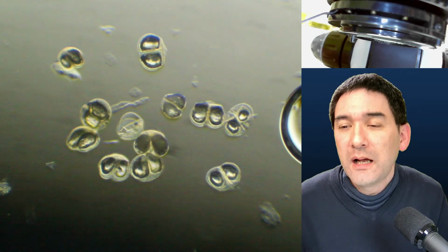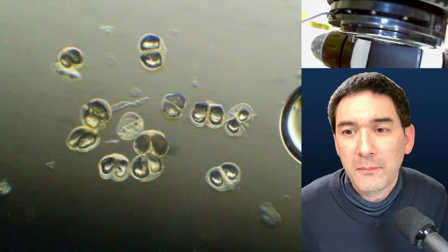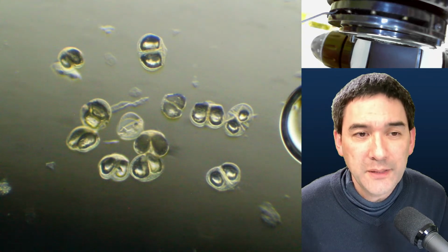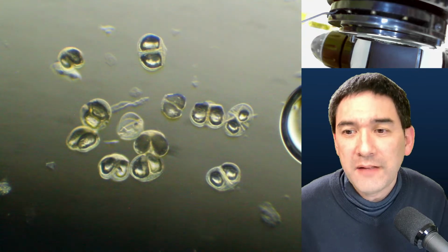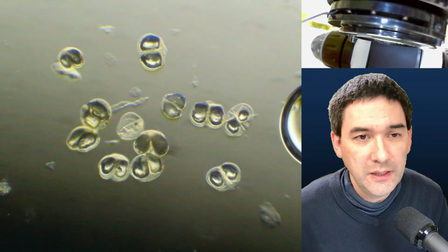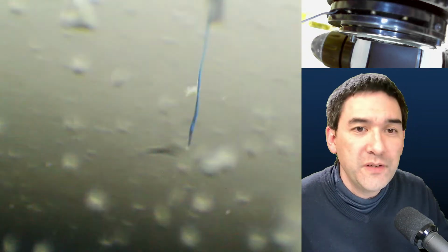That's another thing. When making mounting media, there is always the problem that sometimes there are bubbles in there. So applying a vacuum would be quite useful. Okay, a vacuum chamber. In one of the previous videos, I showed some video clips from a viewer, Hadrian, who has basically made one.